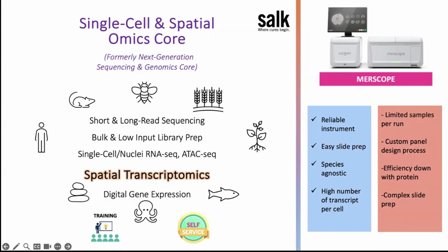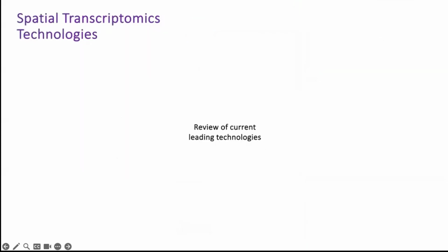The limitations are that we are limited with the number of samples per run. The analyzable tissue area is kind of small. The custom panel design process is kind of tedious. And also we've noticed the efficiency of the technology goes down when we add protein in the assay, even if you add just one protein. And the slide preparation is kind of complex.